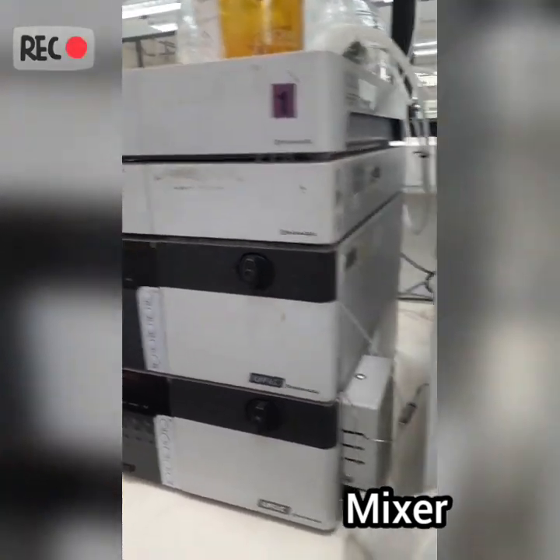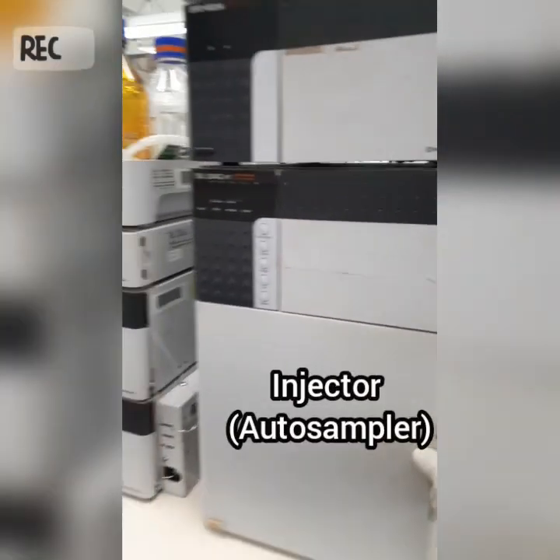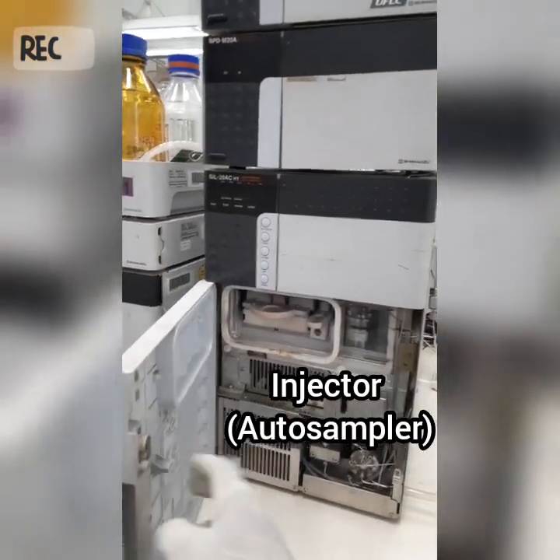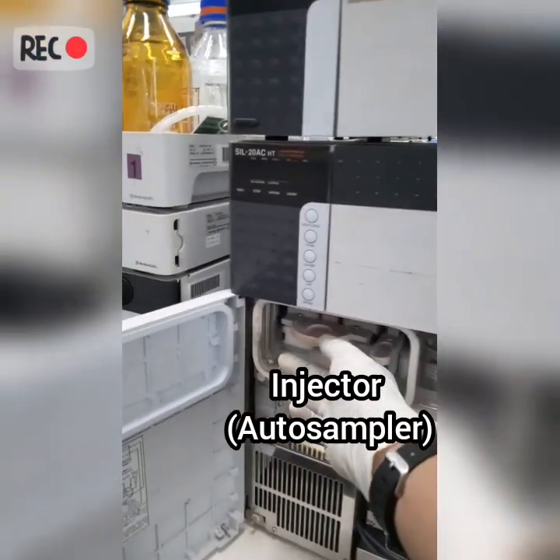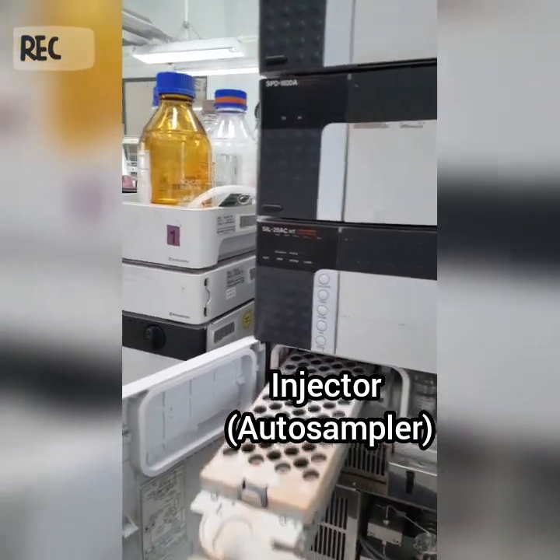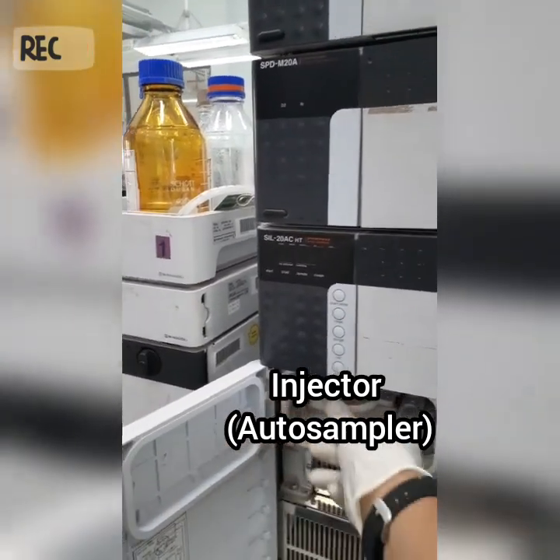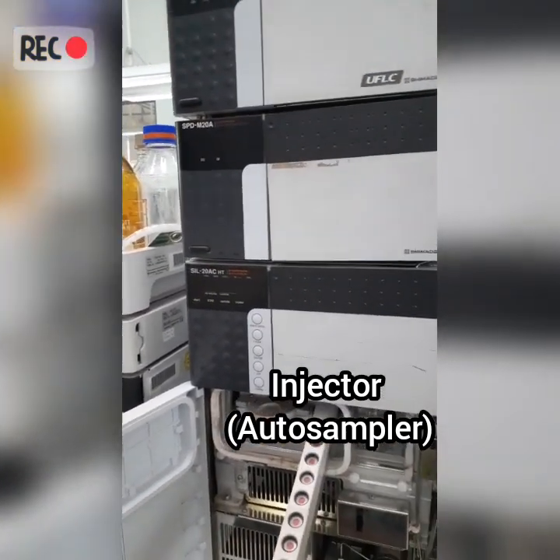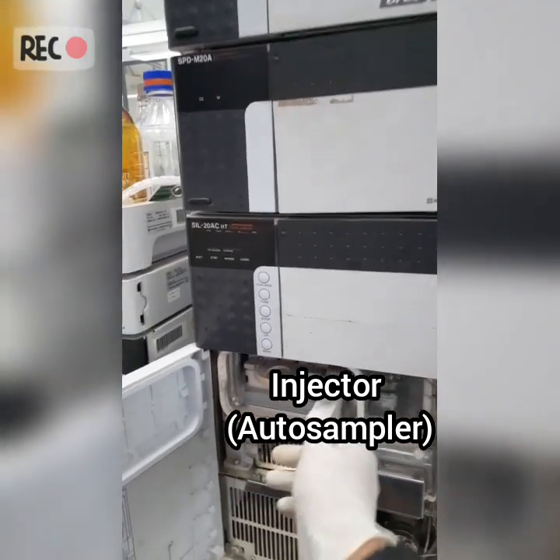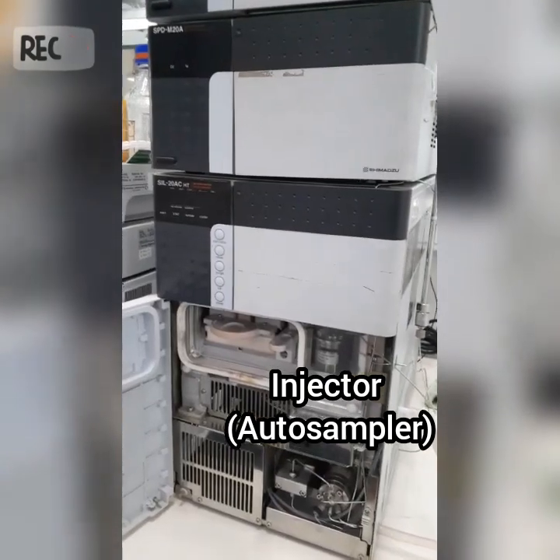Okay, this is the mixer, and then it goes to the autosampler. Yes, this is the autosampler or injector. There are 70 vials plus 10. The total vials that can be injected is 80.